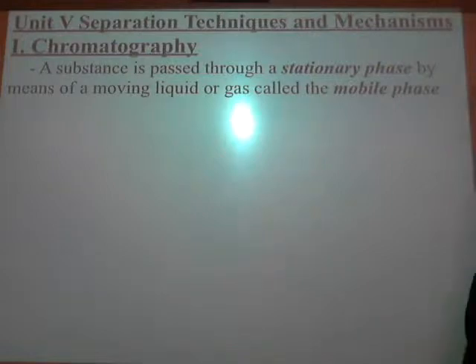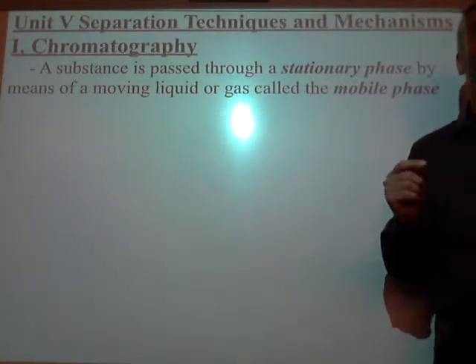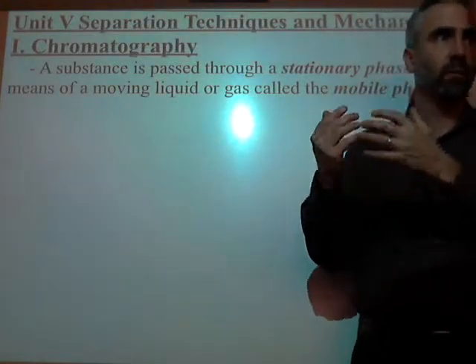All right. So in the case of chromatography, the stationary phase is just filter paper, and the mobile phase is some liquid, usually a different combination of chemicals that have a varying polarity, depending on what you want to separate. Now we can identify and separate these based on how far they move or how fast they move up that paper. Some of the colors are going to be attracted more to the paper than to the liquid moving through it.